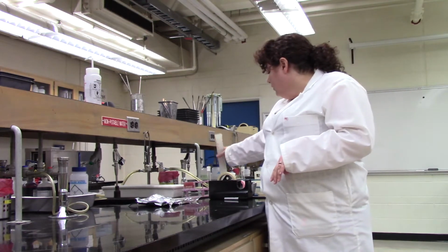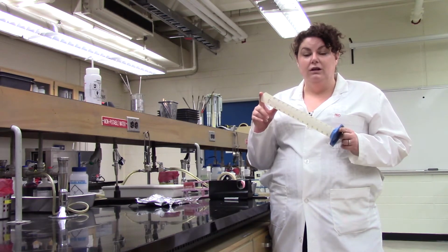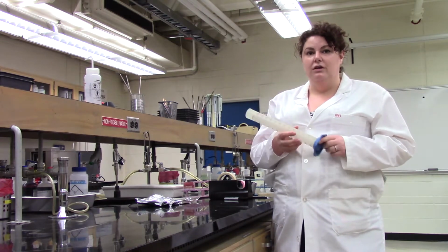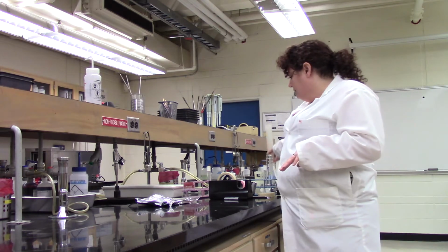So in terms of things that can and cannot go into the autoclave, a lot of this is just common sense. You don't want to put anything into the autoclave that's going to melt. So that means you're not going to put most of the lab plastics into the autoclave. So don't put our plastic graduated cylinders, other basic plastics like that. Those will melt, so don't put those in.